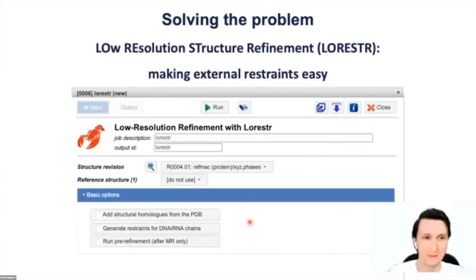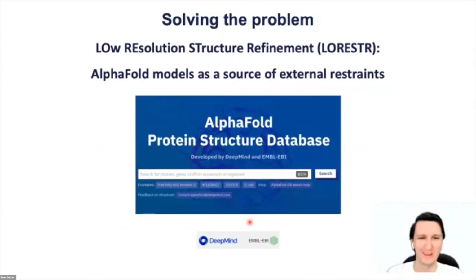Okay, let's speak about something interesting. As you know, recently a real revolution has happened in the field of structural biology. I mean the outstanding performance demonstrated by AlphaFold during the latest CASP competition. This was really a breakthrough in protein modeling, and I believe tomorrow there will be several talks about this. As you may know, DeepMind, together with EBI, has started an amazing project, massive modeling of protein structures from key organisms. Currently, 300,000 pre-calculated models are available, and about 1 million models will be released in the future.